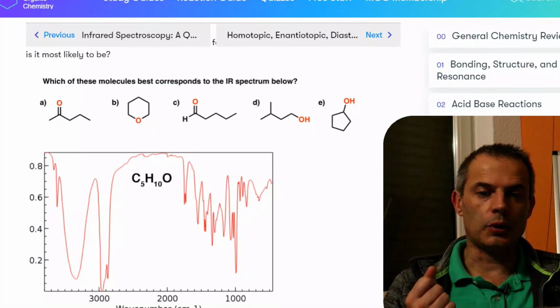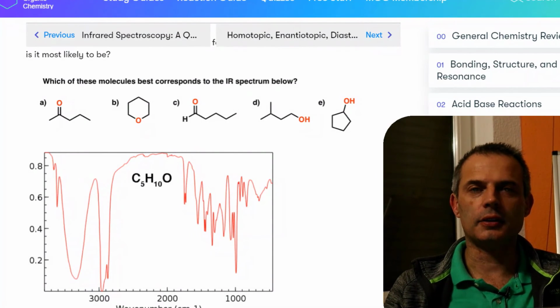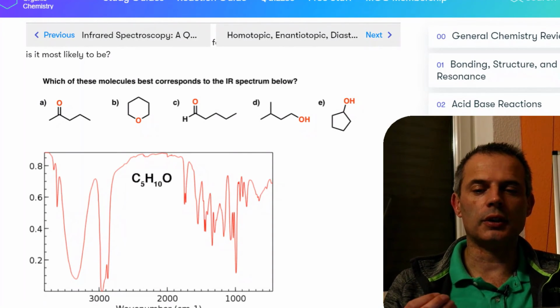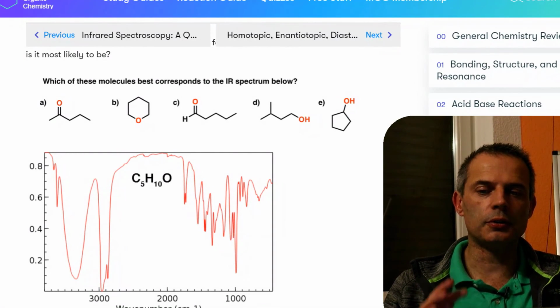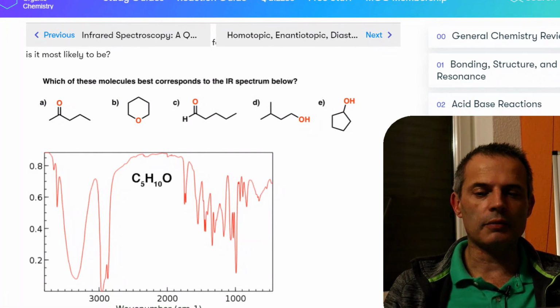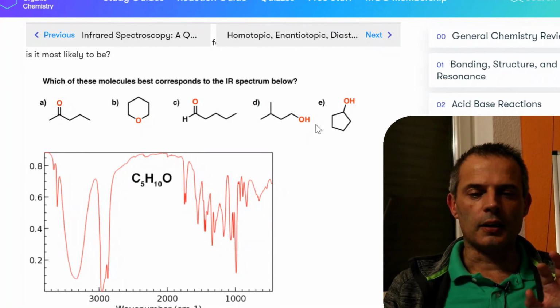So this is what we would expect to see as an example problem that we may get for organic spectroscopy in infrared. We will not add too many other types of spectroscopy to this, because the next one for a chemist would usually be NMR, and we probably won't manage that. We'll have a go at it this time, but it's a different type of spectroscopy and it works in a completely different way. Let's have a look at this.